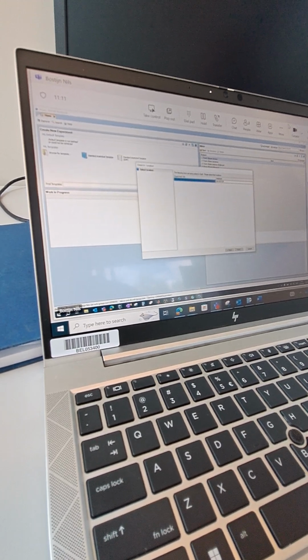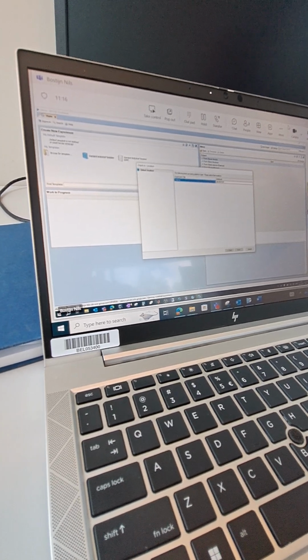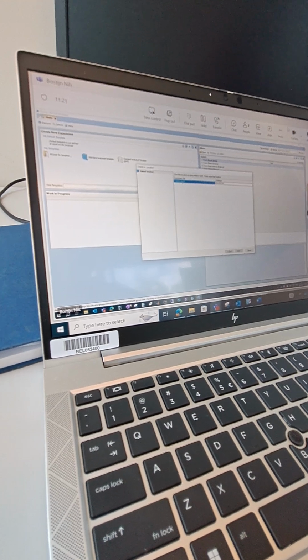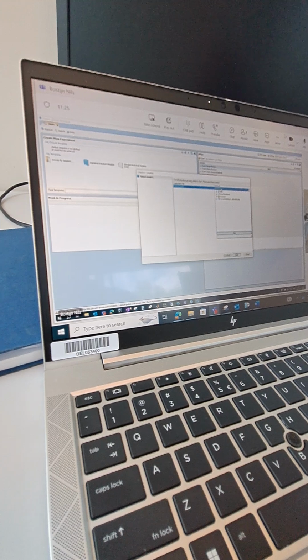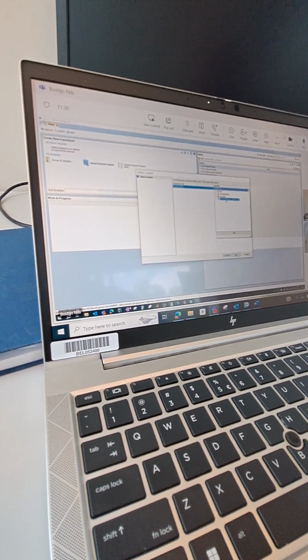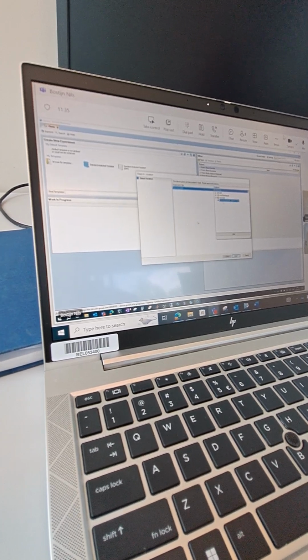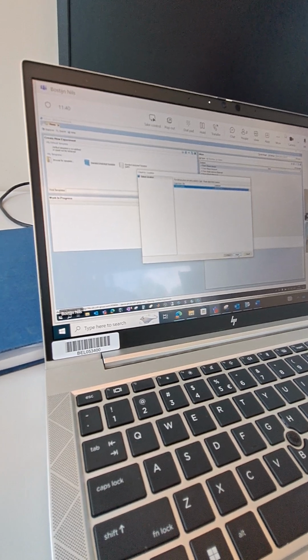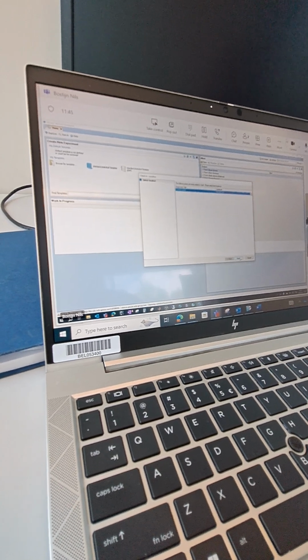If you click on it, you will then need to give a title, for example, training Sadia. You can still modify the title later, so if you want, you can give something quickly now. And then here in notebook, you need to click on current notebook. It will then be with your name instead of mine. So you click on it and it's selected. Then you can do finish and it will create an ELN. So that's the first step to create one.